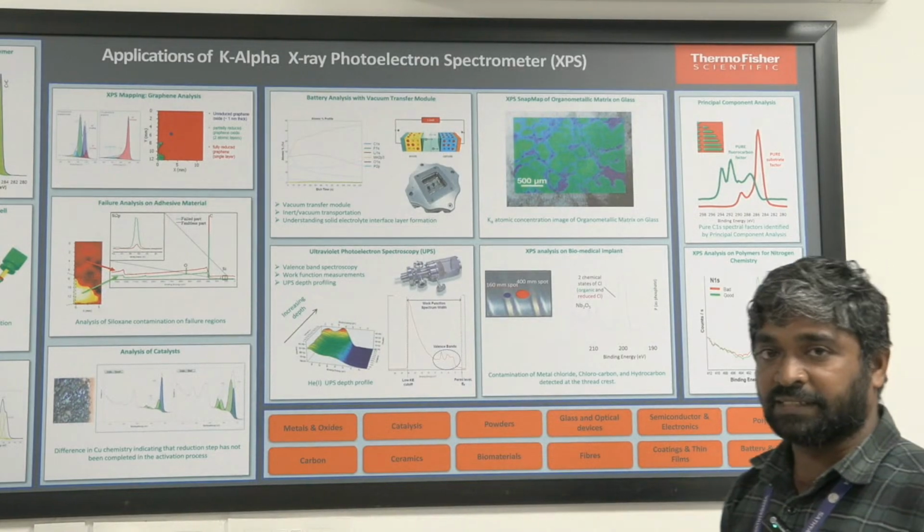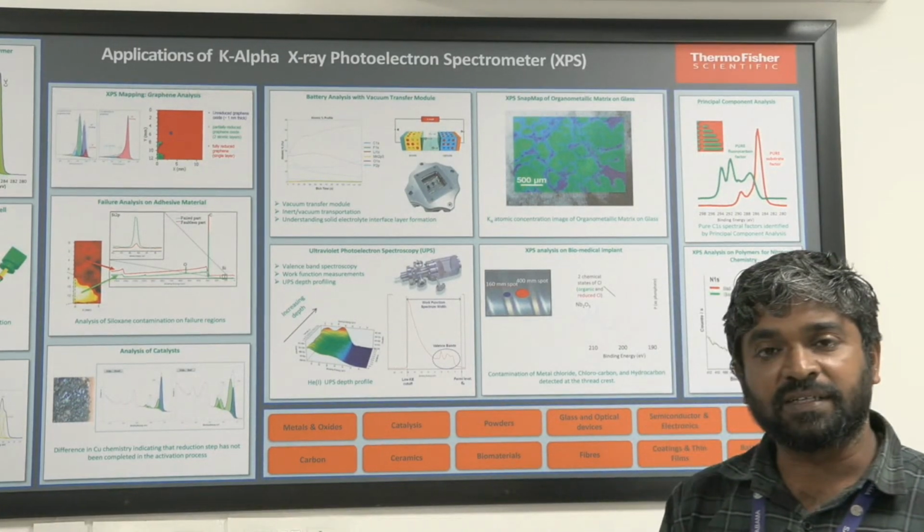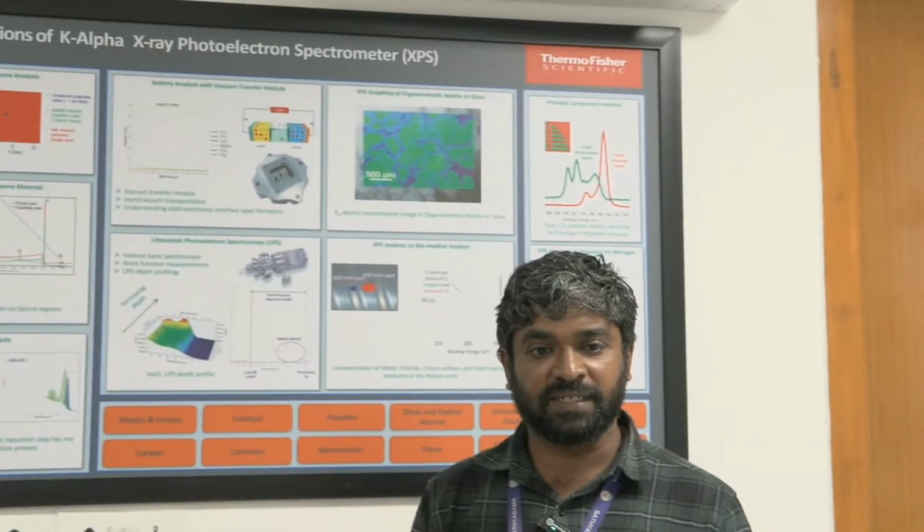And these are the failure analysis. So from all the disciplines, from biomedical to material science and materials chemistry, corrosion, and all kinds of surface phenomena, how the material changes can be confirmed, and the chemical compositions can be identified in this XPS system.